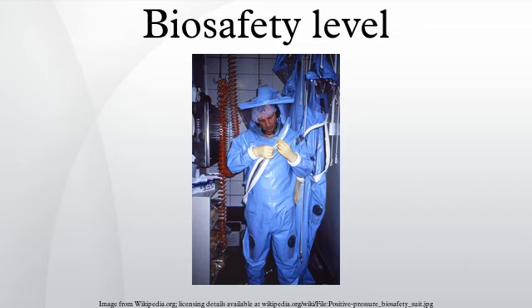Levels: Biosafety Level 1. This level is suitable for work involving well-characterized agents not known to consistently cause disease in healthy adult humans, and of minimal potential hazard to laboratory personnel and the environment. It includes several kinds of bacteria and viruses including canine hepatitis, non-pathogenic Escherichia coli, as well as some cell cultures and non-infectious bacteria. At this level, precautions against the biohazardous materials in question are minimal and most likely involve gloves and some sort of facial protection.